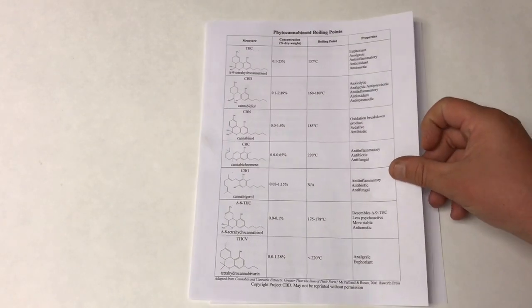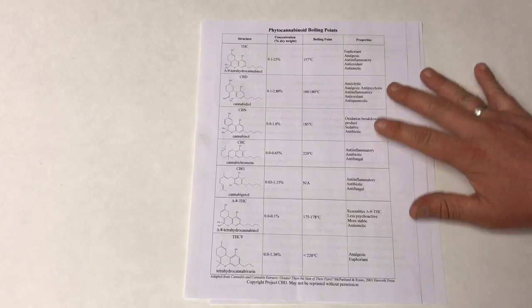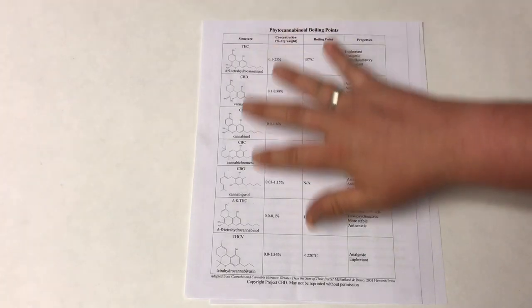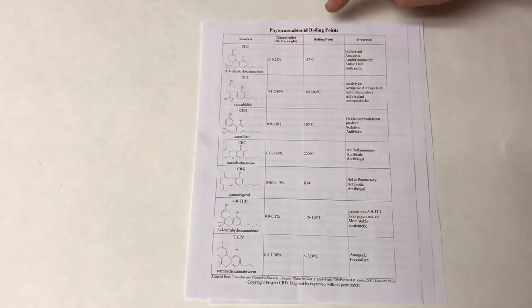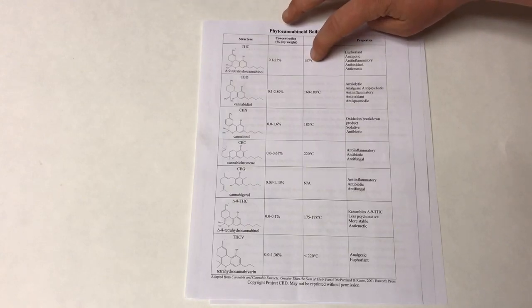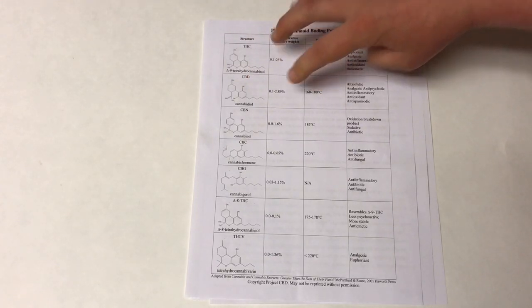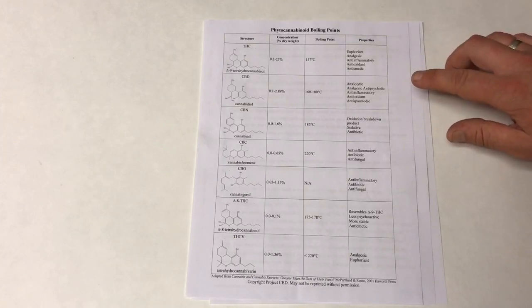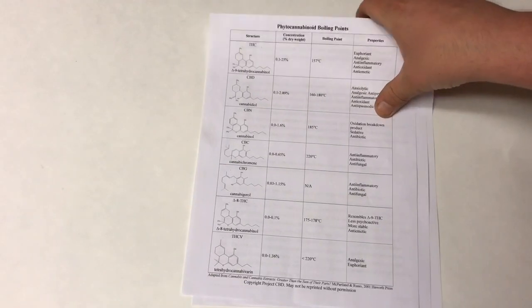So when we talk about molecular separation, molecular distillation, for an example here I have some phytocannabinoid boiling points, and these are different molecules that are found within a cannabis crude oil. Starting with THC, you can see that the boiling point is 157 degrees. And then the next one is CBD, from 160 to 180 degrees. And as you get down the line, these different molecules will all have a different boiling point or a different distillation rate. And so that's how we're able to separate these different molecules.